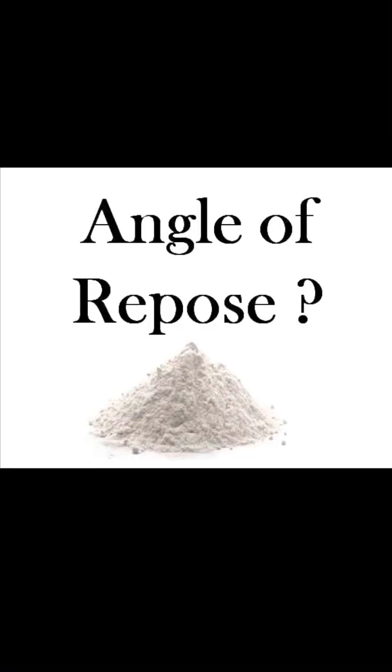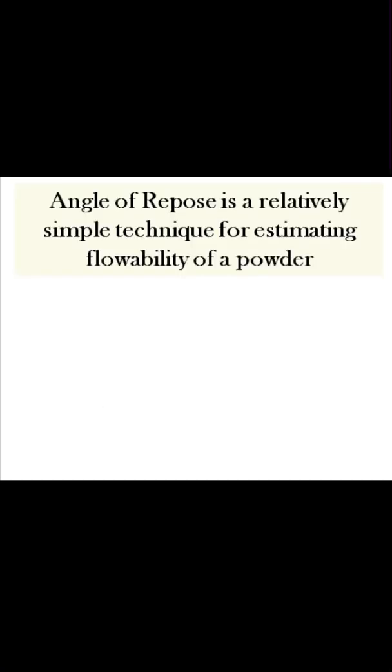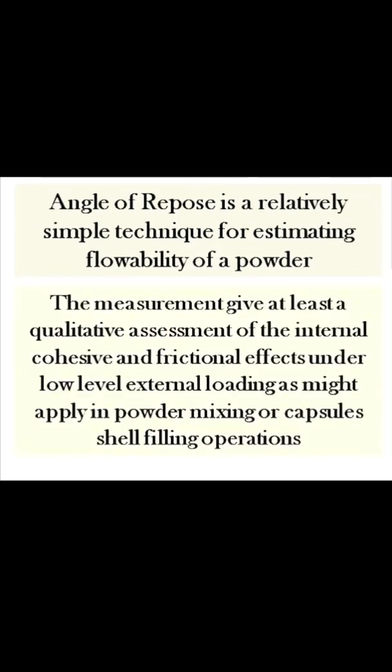Before we start any further, what is angle of repose? Angle of repose is a relatively simple technique for estimating the flowability of a powder. The measurement from the angle of repose gives at least a qualitative assessment of the internal cohesive and frictional effect under low-level external loading, as might apply in powder mixing or capsule shell filling operation.